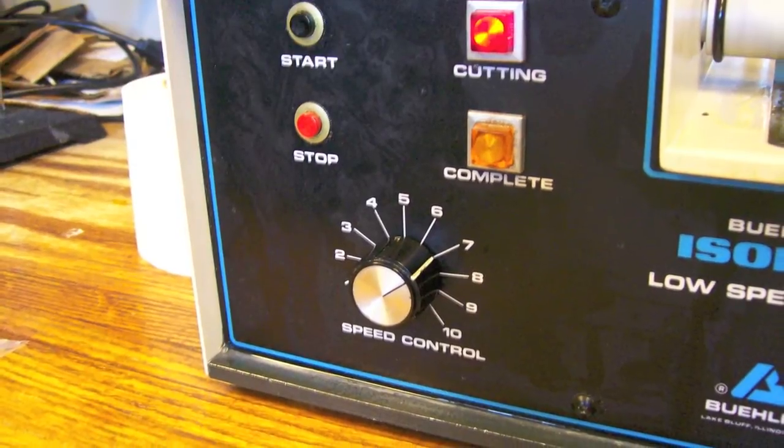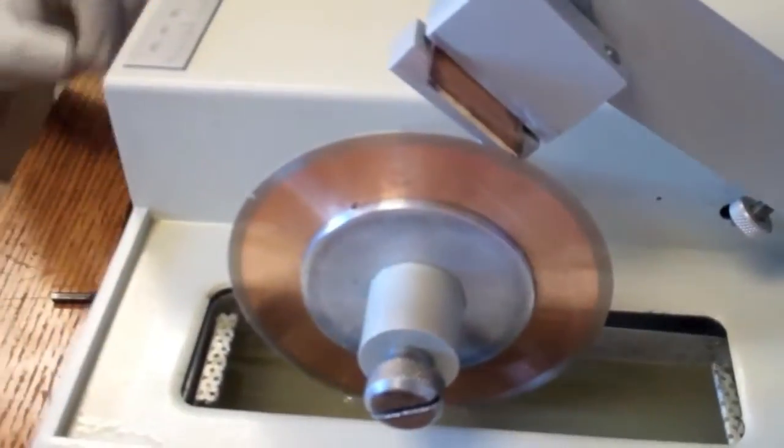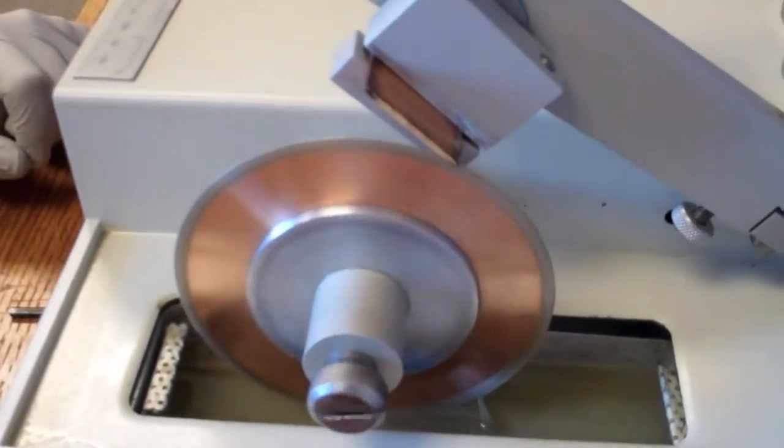The cut piece can be removed and the knob can be used to translate the material for the next cut. Once the material is repositioned, another cut can be made.